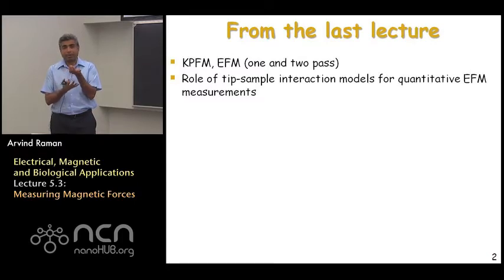In electrostatic force microscopy, in contrast, one needs to consider not just the proximal end of the AFM tip in coming up with interaction force models, but one needs to consider the entire geometry of the tip, and very often the geometry of the cantilever itself, which leads to much more complicated expressions that relate the geometry of the cantilever to the forces being experienced and being measured.